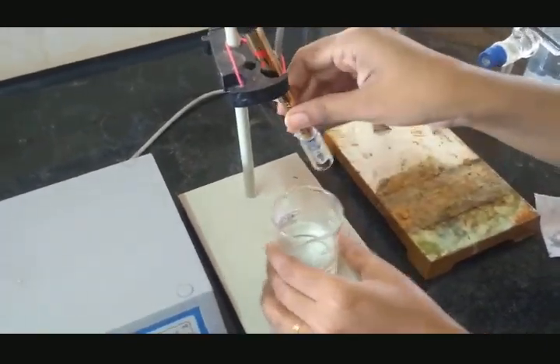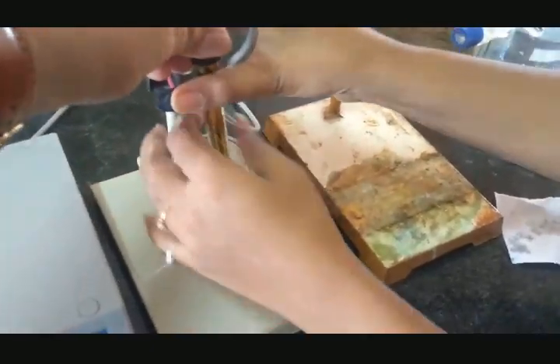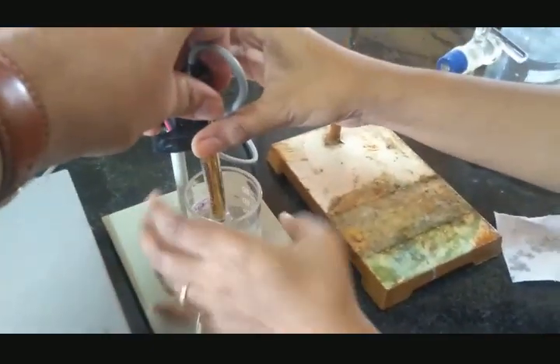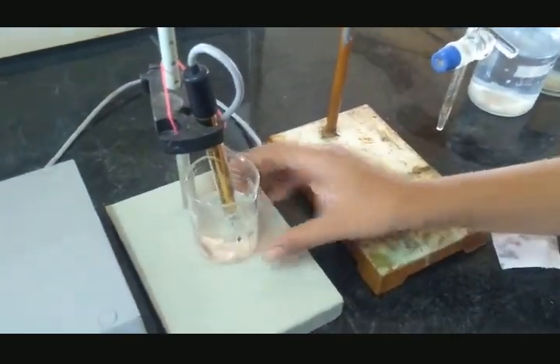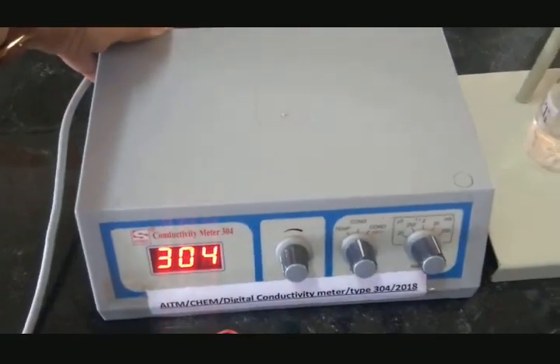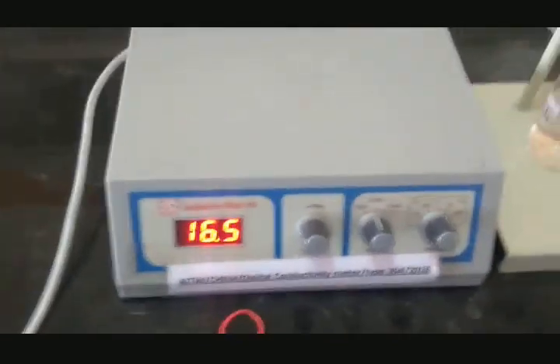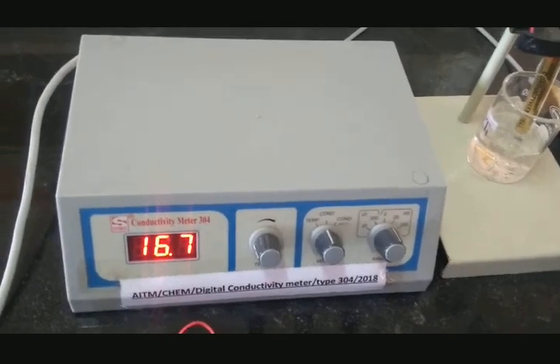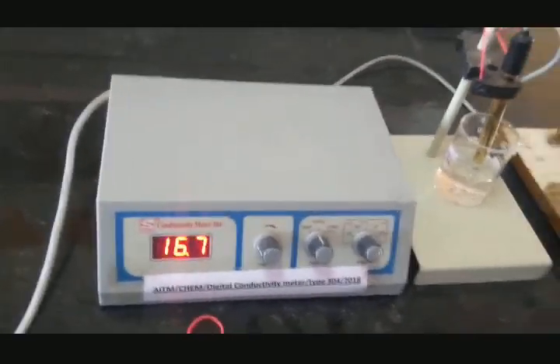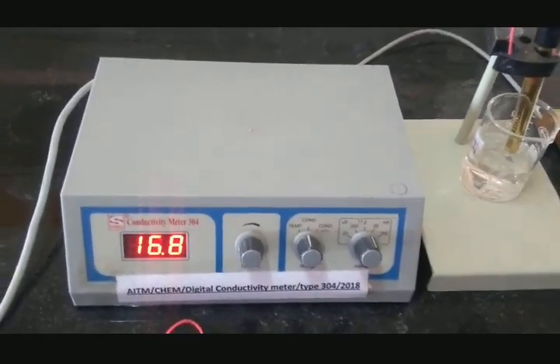So keep the conductivity cell immersed in the acid mixture. Once you immerse, switch on the instrument and you get some value, that is your zeroth conductivity, that is 16.7. So note down the value at the zero, which is 16.8.